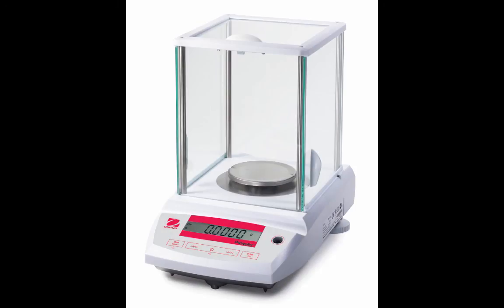The last source of error we'll discuss is a little bit different than the others. Those other sources of error are avoidable sources of error. In this case, we'll be discussing random error, which is error that you can't avoid in your experiment. Every single time you run a trial using any measuring tool, including a balance, you're going to get slight variations in the results you get. And these are all due to factors that you can't necessarily control in your experiment. This will lead some values to be a little bit high, some values to be a little bit low, which is why we do multiple trials when we perform each experiment.